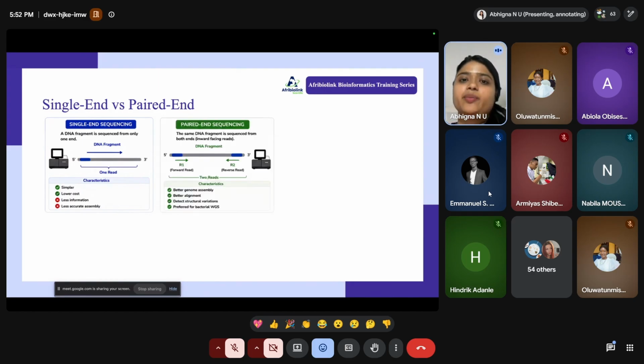When you look at paired end sequencing, the sequencer runs the sequencing from both ends, which is the forward read and the reverse read, where we obtain two FASTQ sequences, and we trim both the ends which are of low quality. So when we go for two reads, where one has failed in sequencing, the quality is higher.